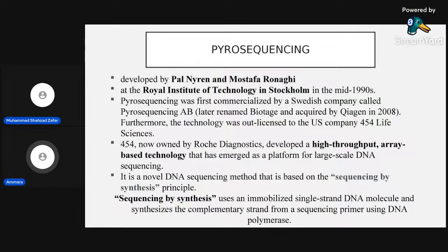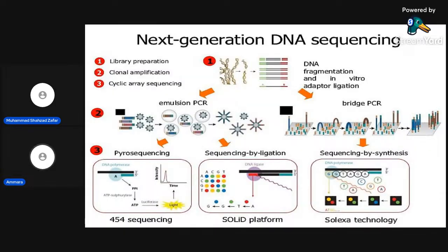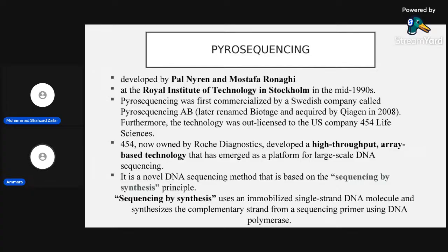The next is Solexa technology and Illumina technology. How is that technology different from pyrosequencing? Pyrosequencing, we know. Next slide, please. We were discussing pyrosequencing. Light will illuminate. So how does that light illuminate? Whenever our complementary dNTP attaches, pyrophosphate will be released. That pyrophosphate will generate light, and that light is used to detect the sequence of DNA.